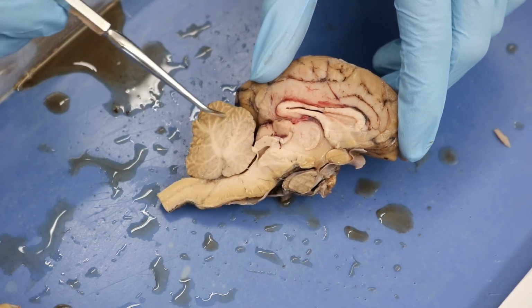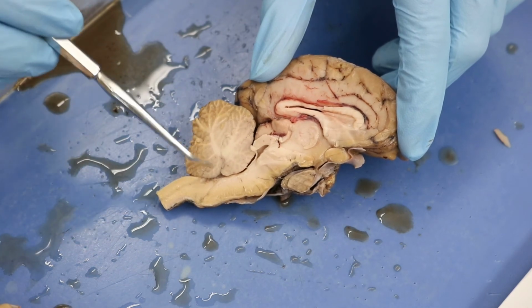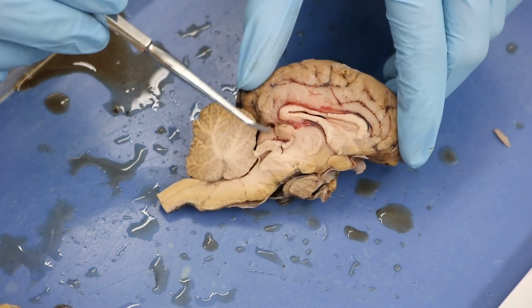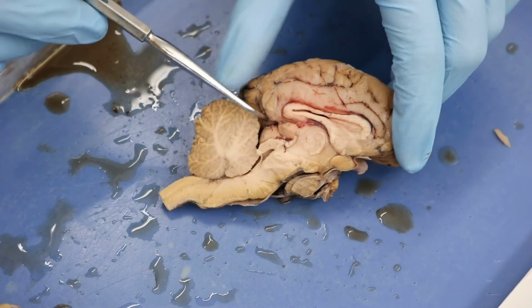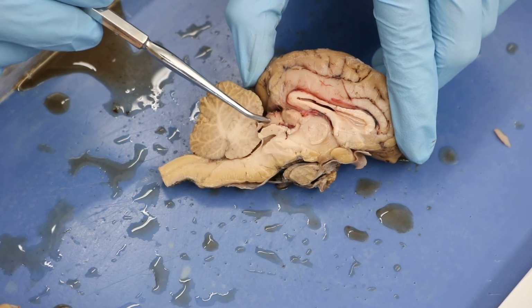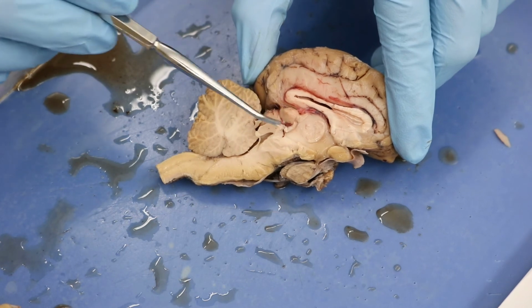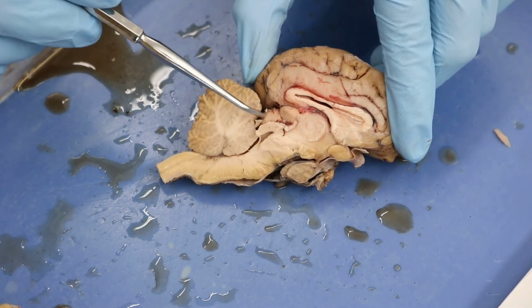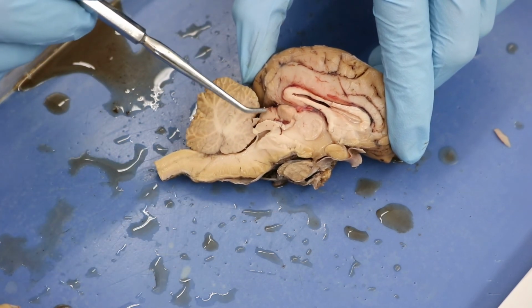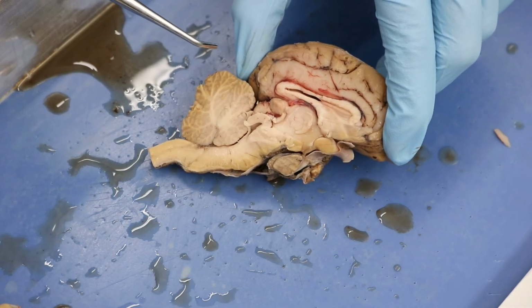This, of course, continues to be the cerebellum, but when it's cut open, we can see this like vine-like stuff, which we call arbor vitae, okay? Now, these 2 structures together are called the tectum. This top one is the superior colliculus, and then this is the inferior colliculus, okay? I shouldn't say they are the tectum, they are found within the tectum, okay? So remember, these 2 here and the 2 from the other half together would be the quadrigemina. And so they're within the tectum, superior colliculus and inferior colliculus.